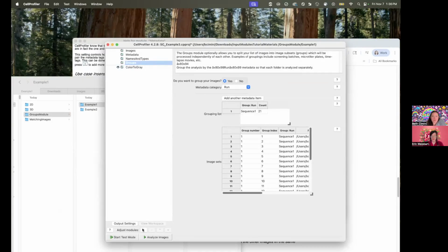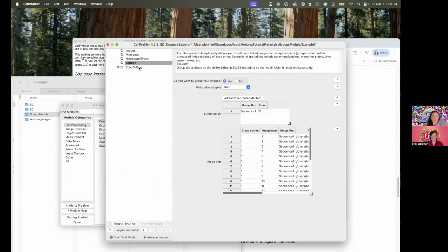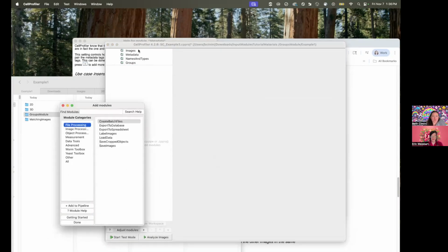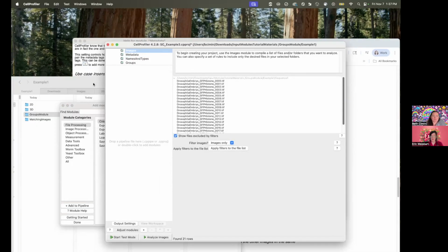So this wasn't the thing that I was expecting it to be. But considering my CellProfiler's drag and drop seems to be on the fritz, we'll pretend that it is. Here I have, oh, I need to bring in a second one.